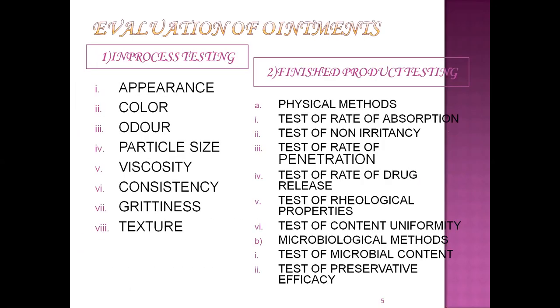These are the few in process tests, that is in the evaluation of ointments. And then in the next class of my video, I will take up the finished product testing, that is physical methods, various methods are there, then the microbiological methods also.